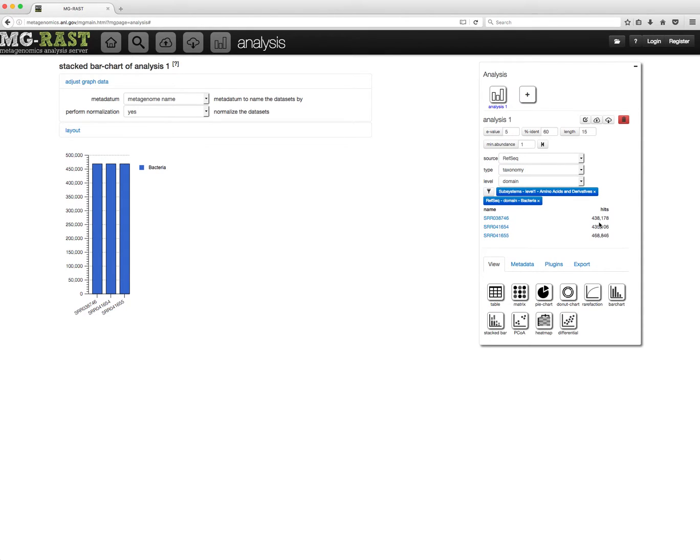Taxonomic and functional filters are AND filters, so all hits have to match both criteria. This concludes this tutorial.